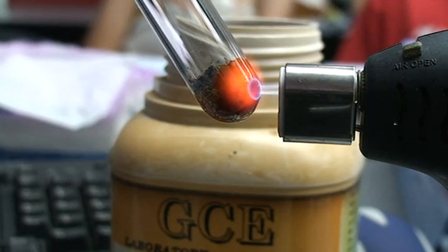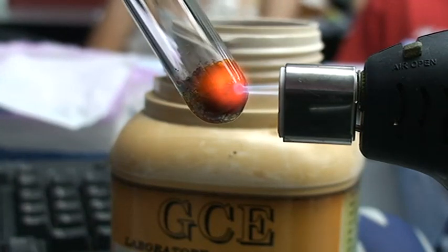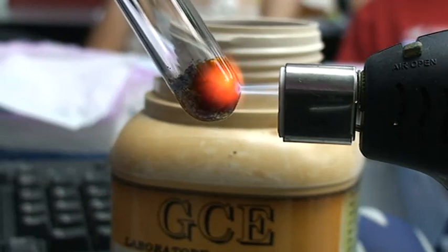As it melts, oxygen will be produced. And the test for oxygen is relighting — using a glowing splint.